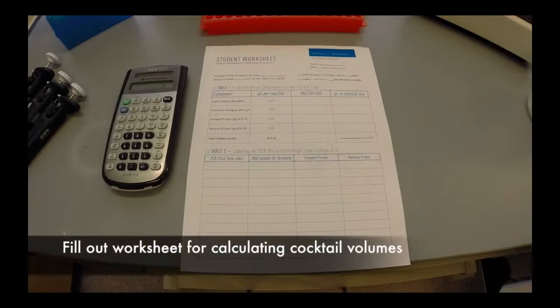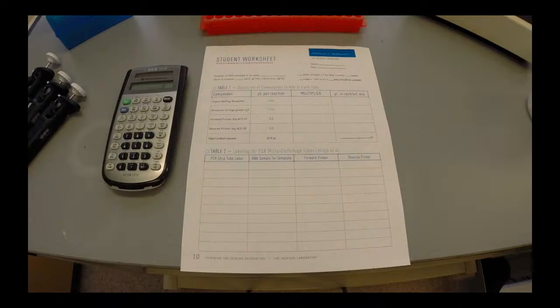Before beginning this protocol, students must fill out the worksheet provided on the last page of this document. This will allow students to calculate the appropriate volume of reagents to mix in the creation of a master cocktail. The purpose of a cocktail is to mix all the common reagents in a multi-sample procedure to avoid excess pipetting and potential errors.